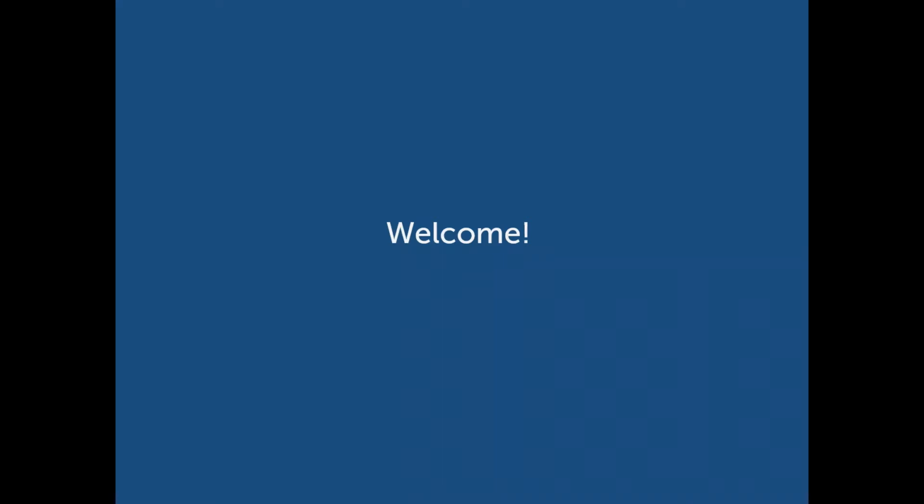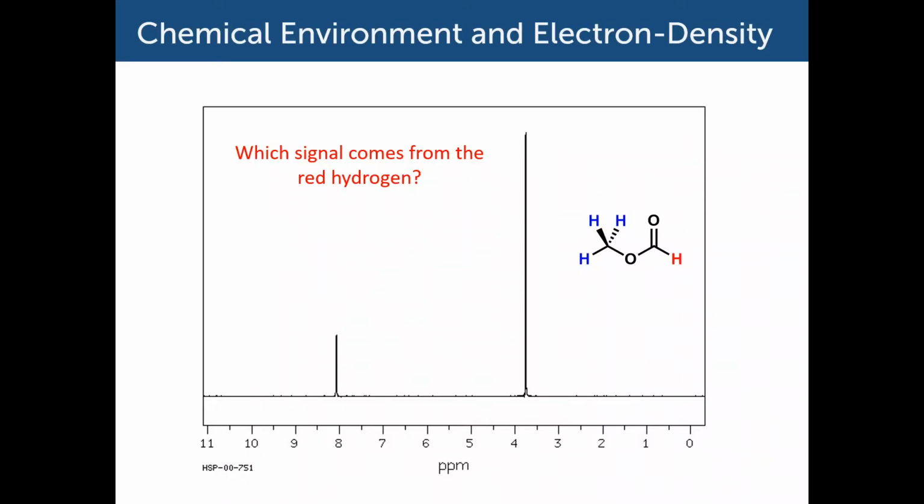And then we'll encounter the second of our major classes of information that we could use to gain structural information from an NMR spectrum itself. So let's get started with our warm-up problem.